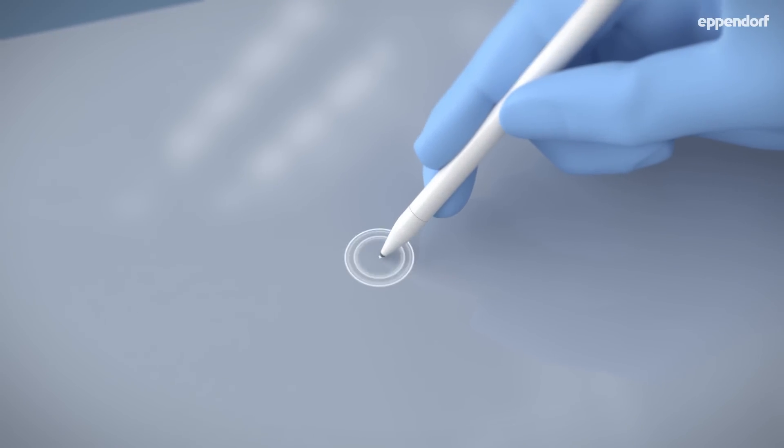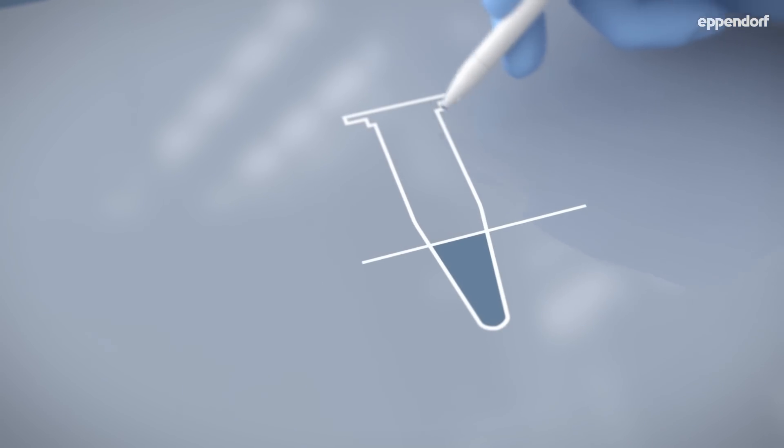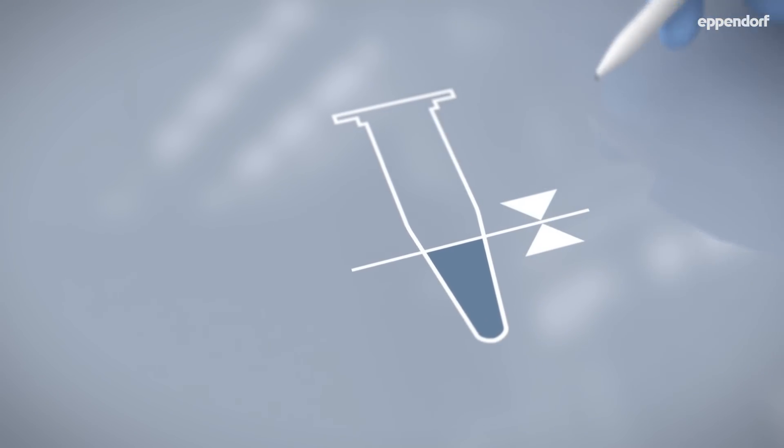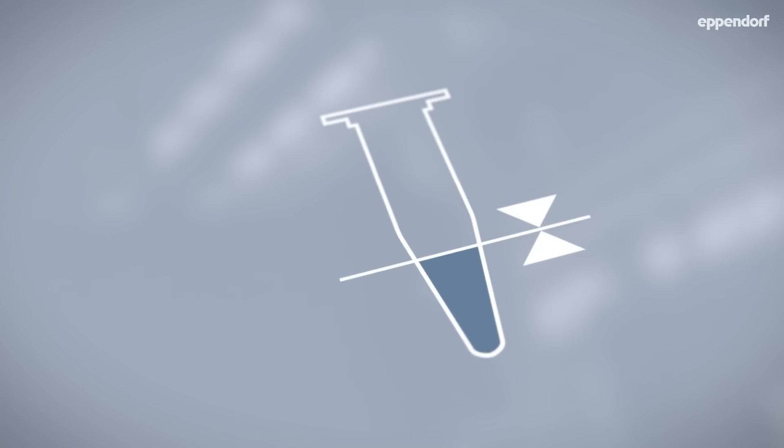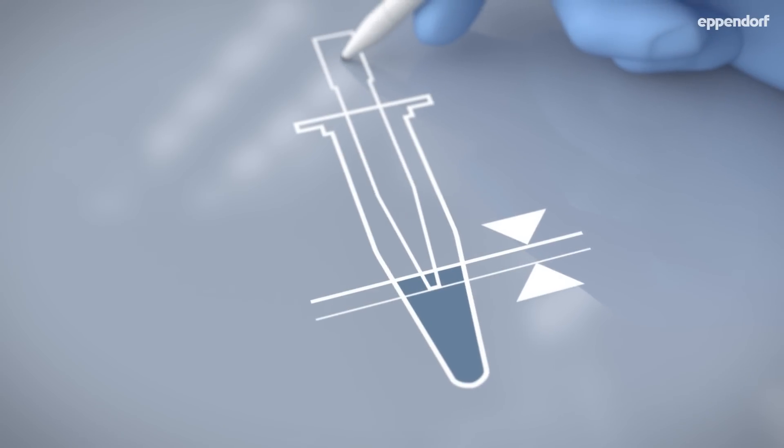First, it's important to get the immersion depth right. In general, you should immerse as little as possible to prevent the transfer of liquids on the outside of the tip. However, you also need to immerse deep enough to avoid taking up air instead of liquid.